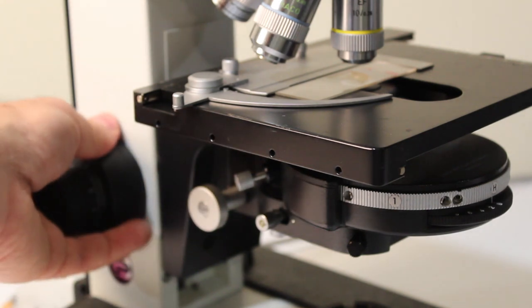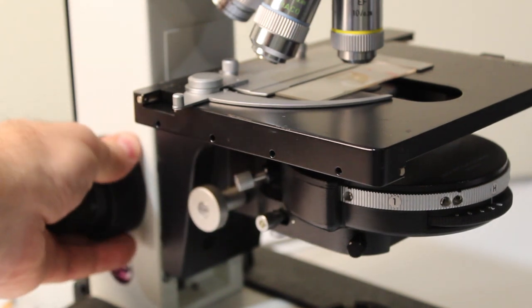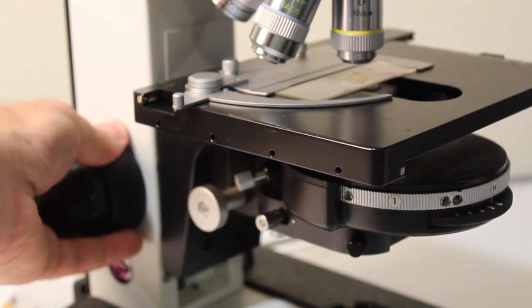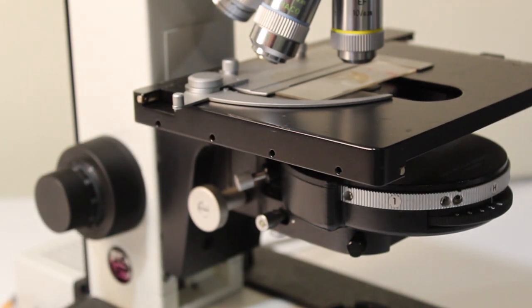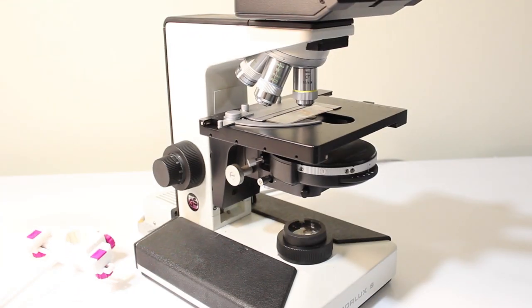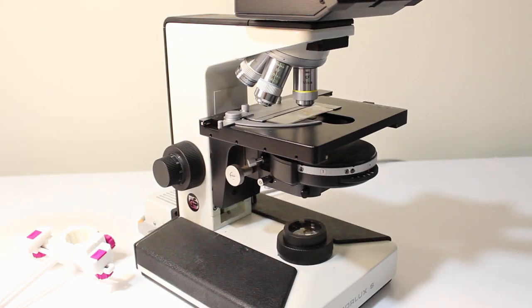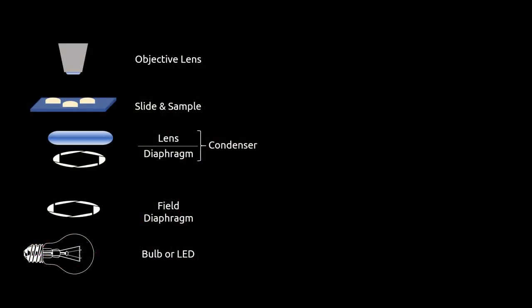The first step is to focus on your sample using your lowest magnification objective lens. If you don't know how to do this, please watch episode 3 of Microbrews. Next, you need to focus the condenser on the field diaphragm. This will ensure that your sample is evenly lit and that the light will efficiently move from the sample to the objective lens.